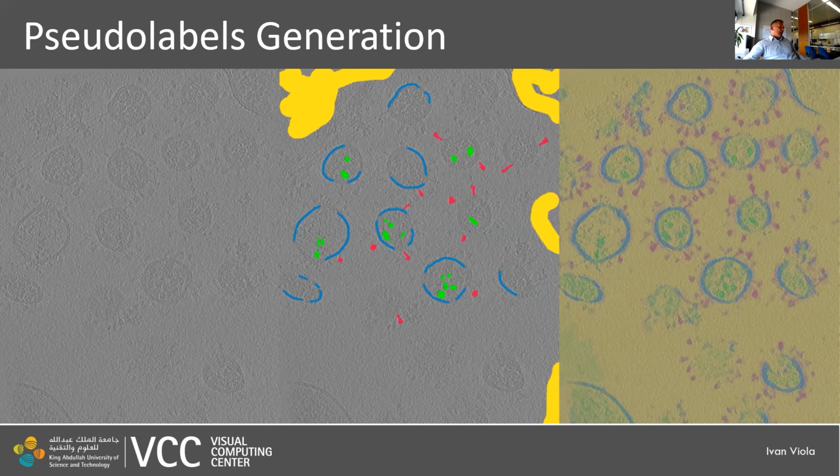And they have concluded that with their tool set, currently, if you want very good representations, you have to go fully ground truth, or you are satisfied with something similar to approaches like our elastic. But I have the feeling that the elastic was performing even slightly better than the tool set which we experimented with in AMIRA.